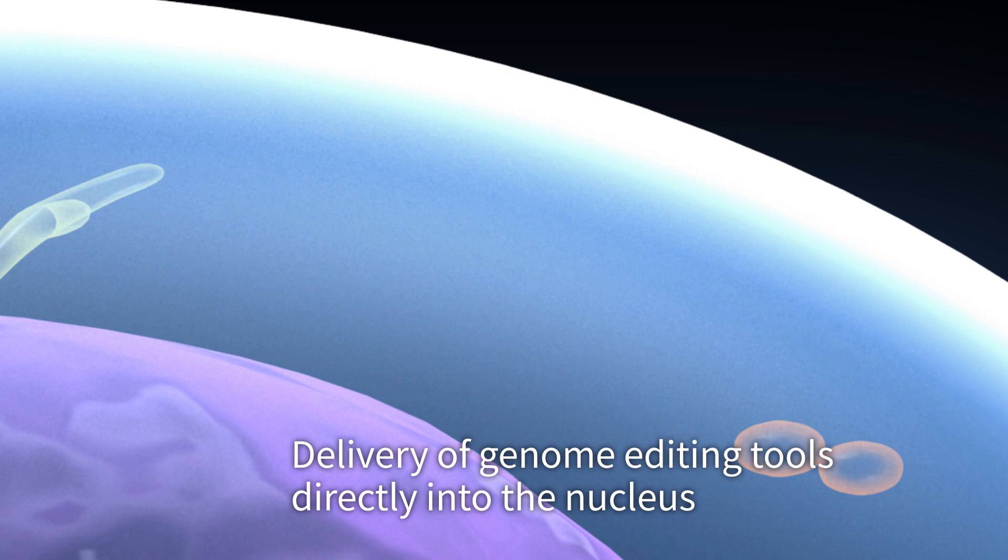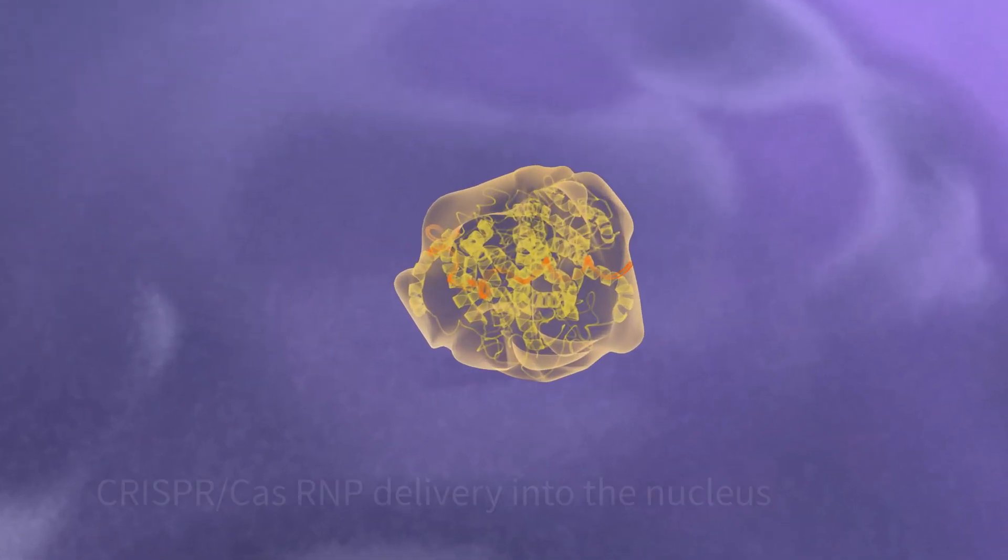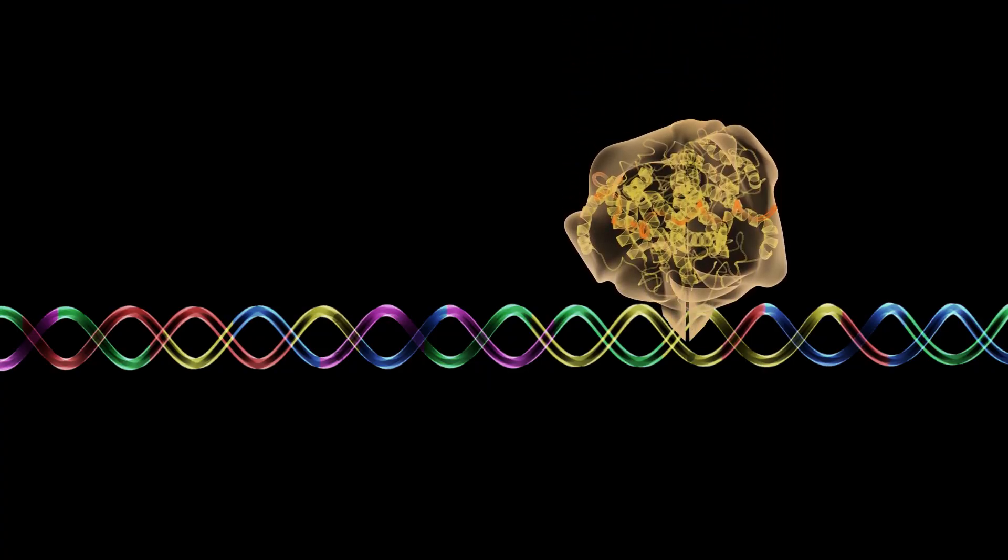Genome editing tools can be delivered directly, intracellularly and intranuclearly. It is also possible to deliver RNP, a complex of protein and guide RNA. These features are expected to improve genome editing efficiency.